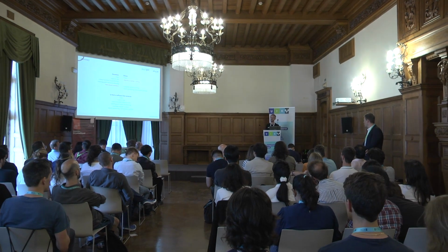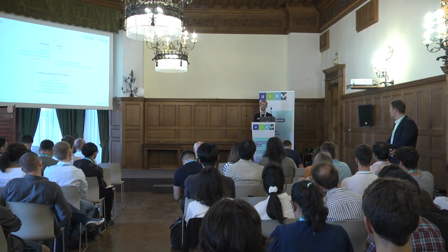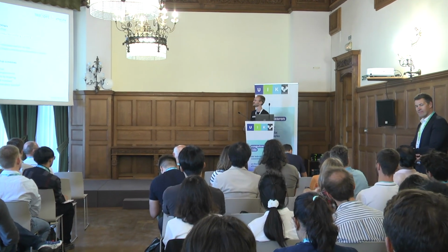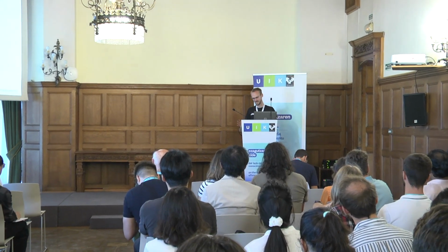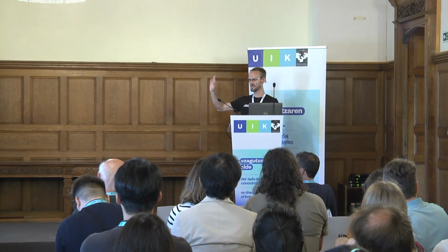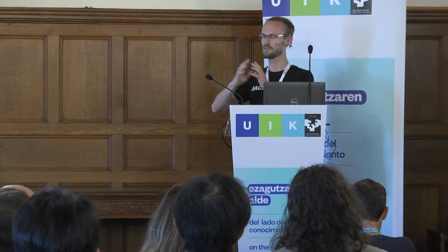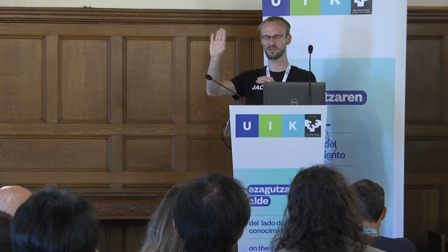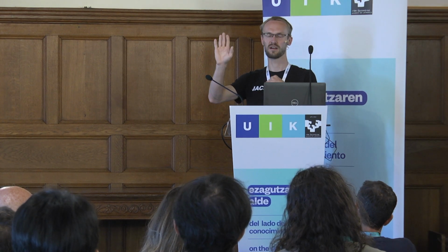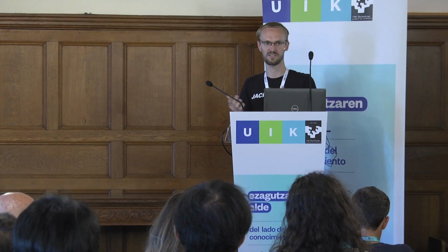So the way I learned is you don't do any post-processing on your data unless you have a reason, and you can explain why. And the goal is to do as little as possible, as little as needed. And for this slow scanning direction, we know it can take 10 minutes, 20 minutes for an image. Interferometer will drift. You have this gradient in that direction. And I assume it's a minimal processing, I just assume it's a linear drift. And I see if this is enough.